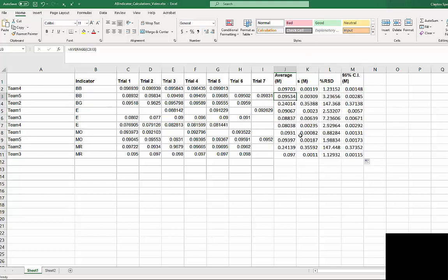And those formulas automatically update for the row that you wanted to use, unless you told it not to by typing dollar signs in front of some of these references. So it's automatically going to do everything correctly for you.